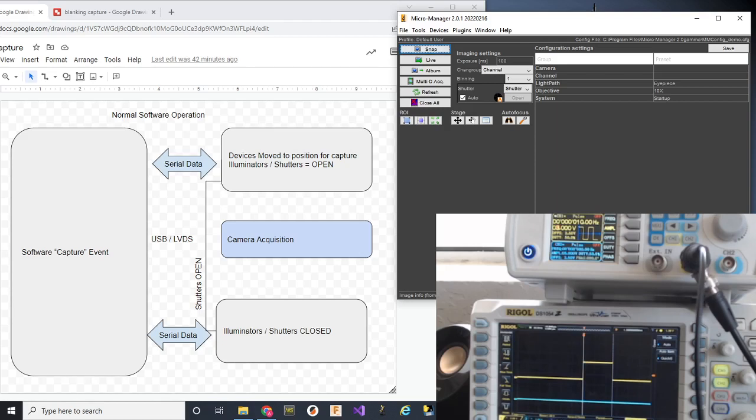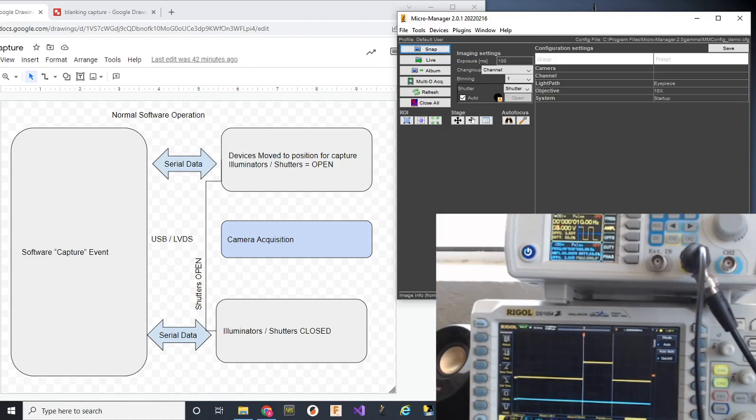If TTL1 is high, the illuminator would be on. And if TTL1 is low, the illuminator would be off. The blue line represents a function generator, which I have up here. The reason for the function generator is to simulate camera read state output.